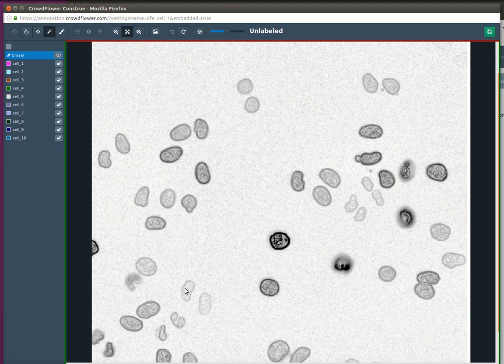For instance, these here, although they're a little bit lighter, would also be marked as cells. And this object here would be marked as one cell too. Now, it might be a little confusing because you could imagine drawing a circle here and a circle here and saying that's two separate cells. But because they have this border connecting them, chances are this is likely one cell.